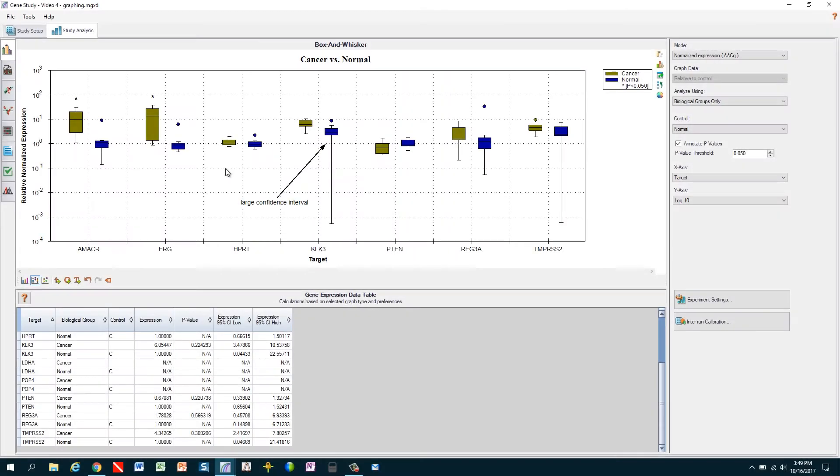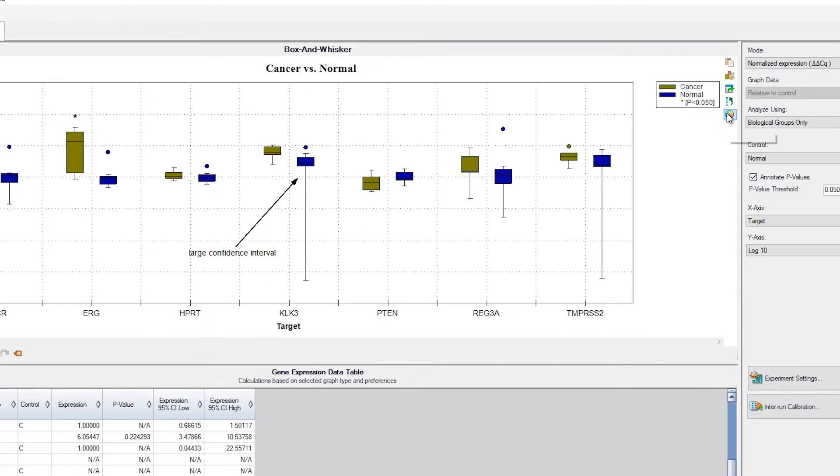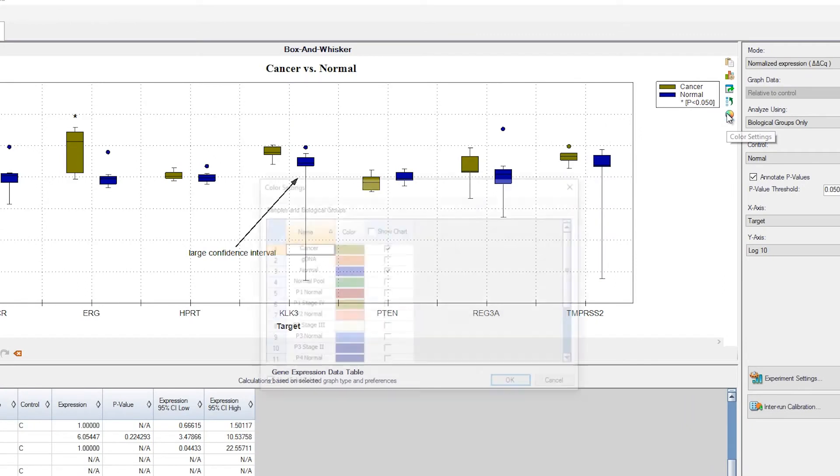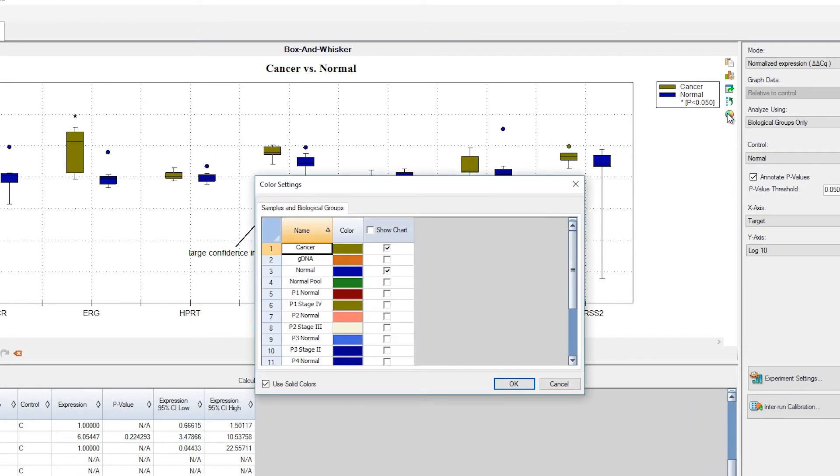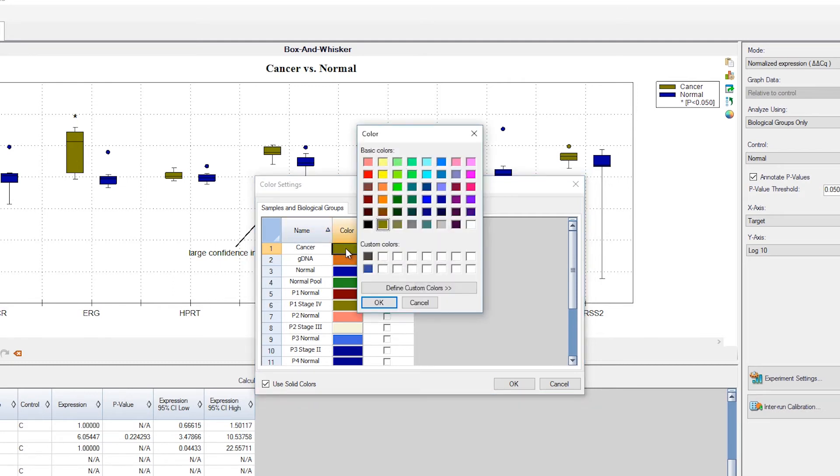Now let's take a look at how to change colors in the graph. We first click on the color wheel to open color settings. Here we can choose to show or exclude any sample or biological group from the graph and can also choose colors for each sample and biological group. Here we'll change the color for the cancer biological group. We click on the target's color and then we can choose from a selection of base colors. But what if none of those are just right?